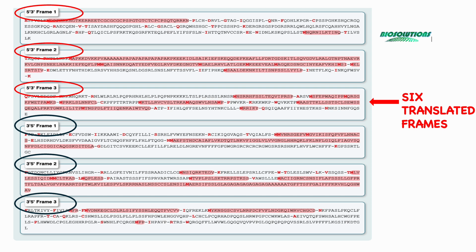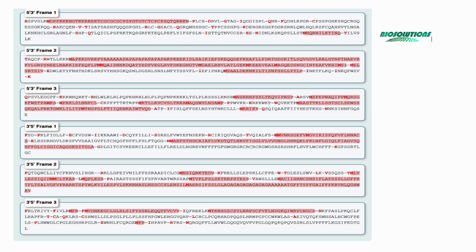You can notice that residues are in single letter code and some of them are highlighted in red. The letter M indicates the start codon methionine. Also, we notice gaps in between, which indicate a stop codon or the end of translation. All the red highlighted stretches show the longest possible stretches or open reading frames, which begin with methionine and end with a stop.